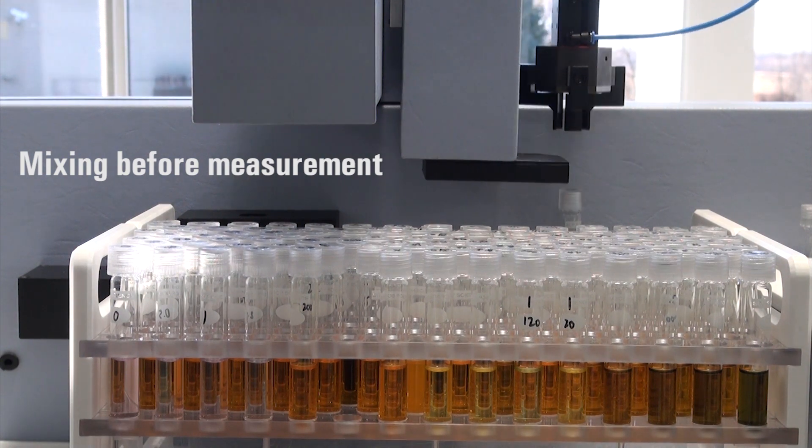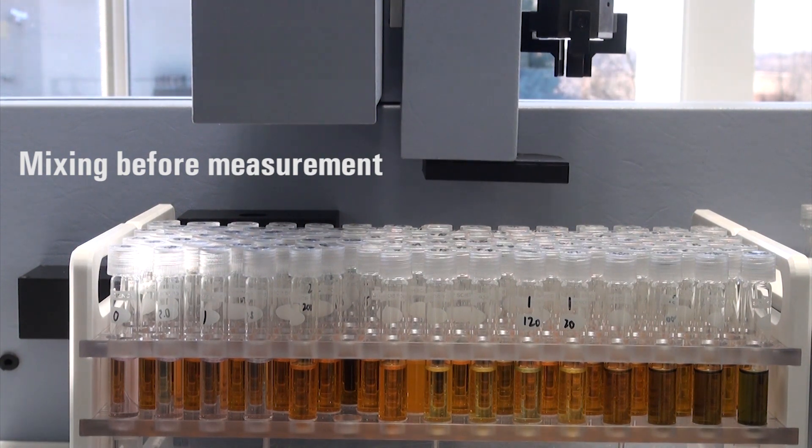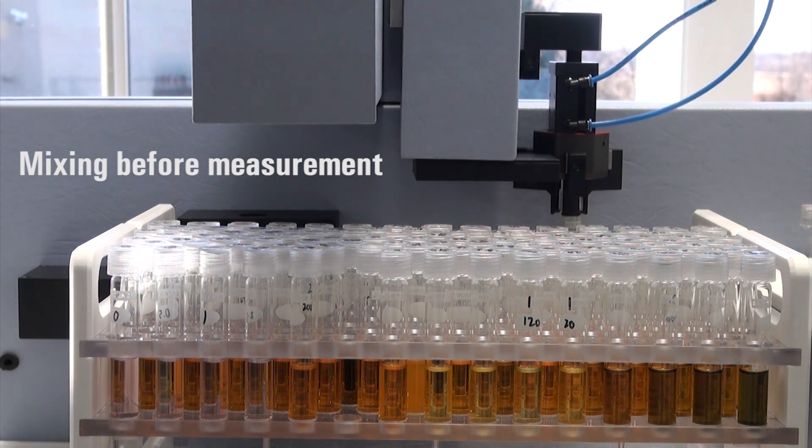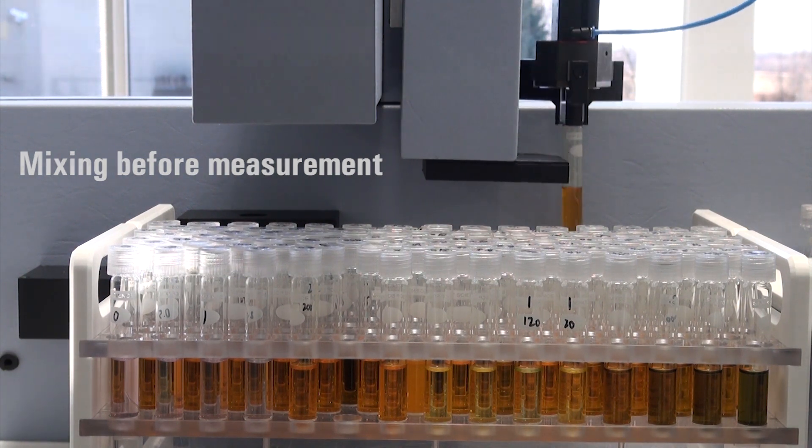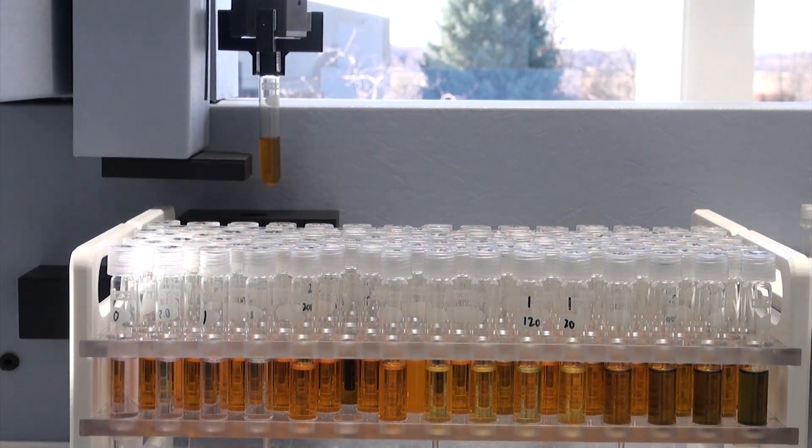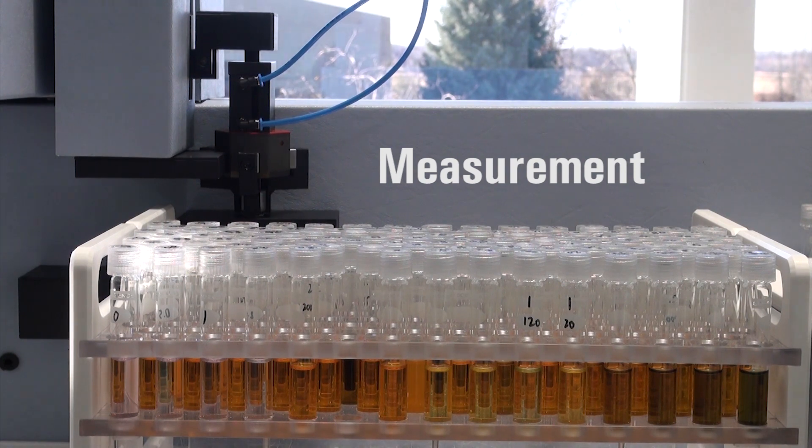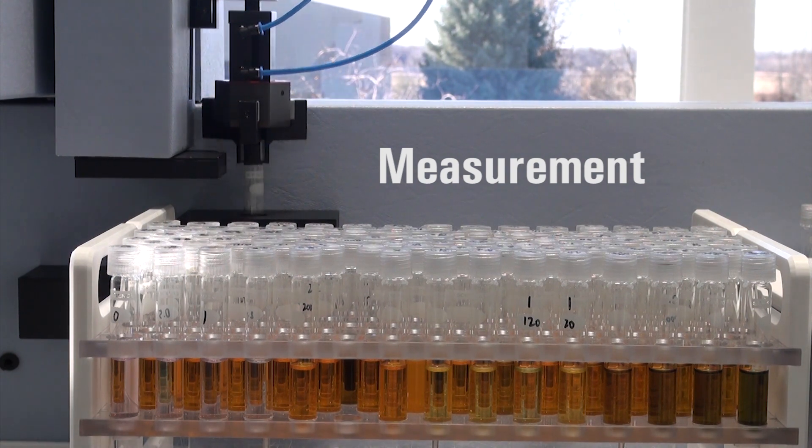COD tubes produced by SCP Science are optically clear for measurement accuracy. A method can be built to analyze low dichromate and high dichromate range samples simultaneously. Use the turbidity detection option in order to perform quality control on each sample.